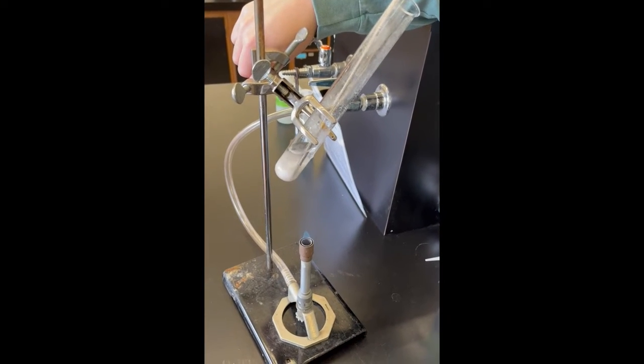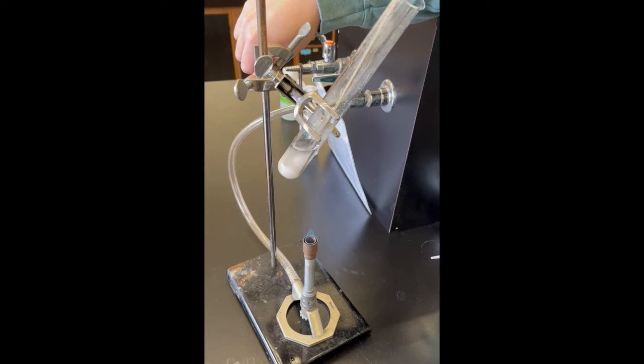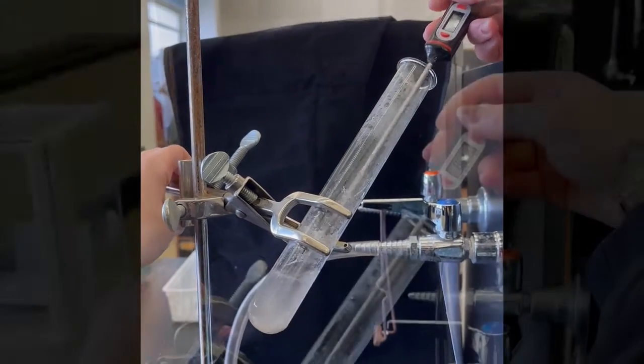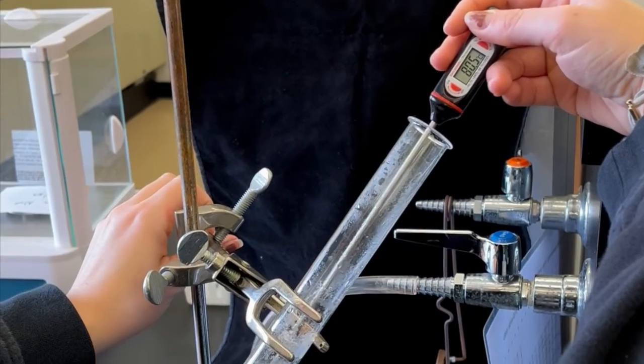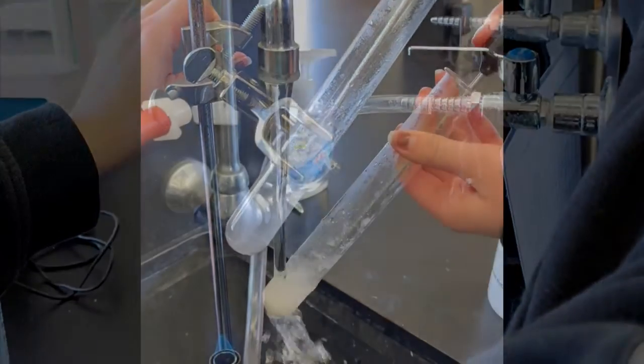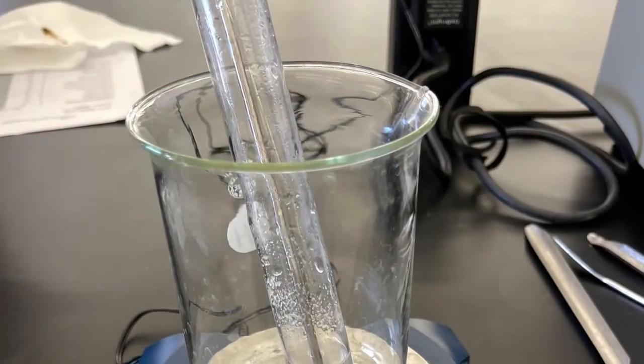When all the salt has dissolved, remove the flame and allow the solution to cool in the air. Continue stirring to prevent supersaturation. Record the exact temperature when the solid begins to crystallize from the solution. When it crystallizes, you should see fine white crystals in the solution. You may use tap water to cool the test tube.